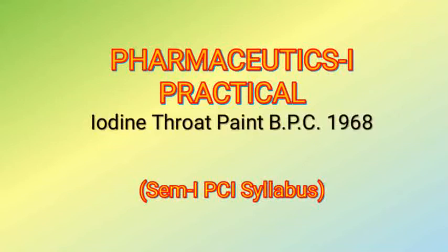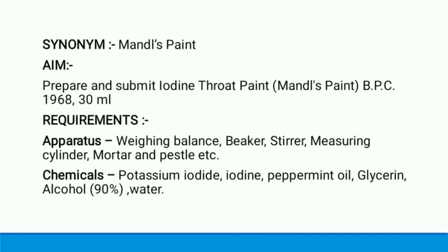In our today's practical, we are going to study iodine throat paint B.P.C 1968. This is also known as Mandl's paint. So let's begin with our today's practical. As already said, the synonym for iodine throat paint is Mandl's paint.